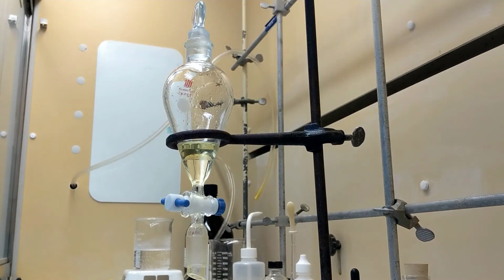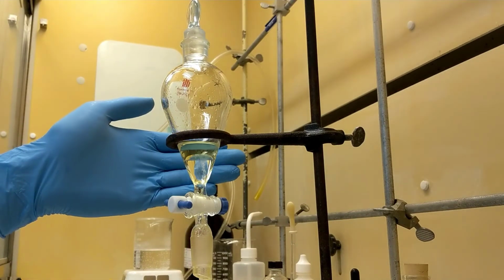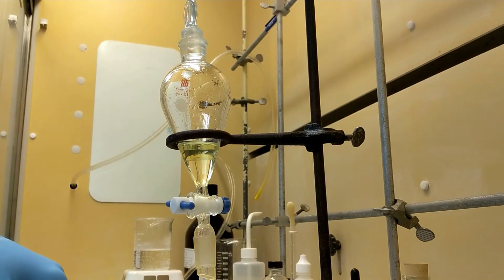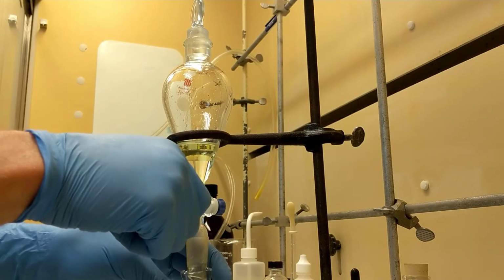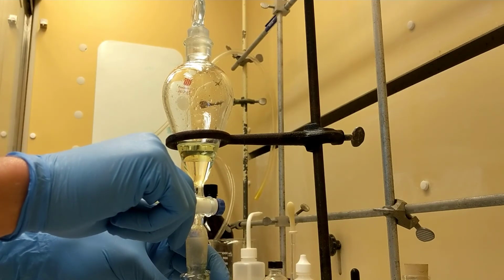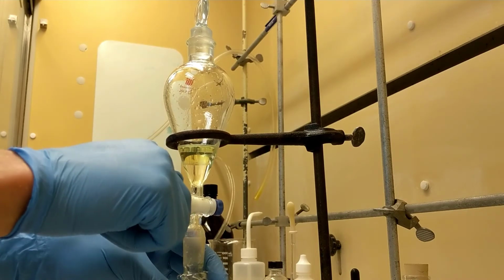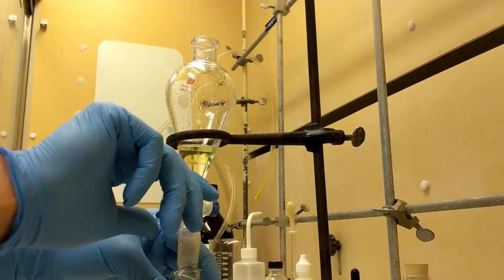So I've been doing all day. Now I'm going to pull off the NaCl, which you can see right here. Just going to pull it off, then dry my ether. Second, that's kind of important.